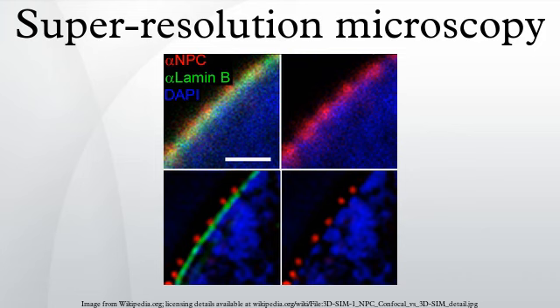for STORM. In this scheme, the activator fluorophore, when excited near its absorption maximum, serves to reactivate the photoswitchable dye to the fluorescent state. Multicolor imaging has been performed by using different activation wavelengths to distinguish dye pairs based on the activator fluorophore used, or using spectrally distinct photoswitchable fluorophores either with or without activator fluorophores. Photoswitchable fluorescent proteins can be used as well.